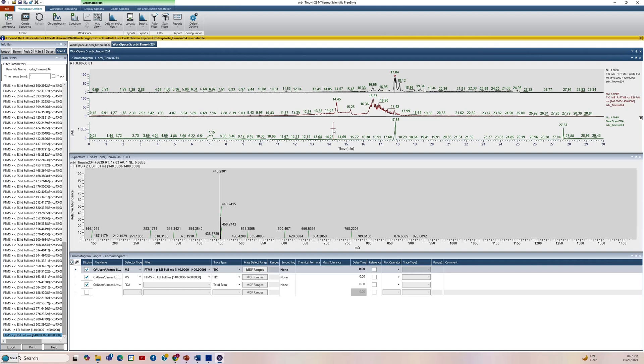So I hope this has been useful. And like I said, I'll do another one on nearby precursors to give you a little bit more information on it. But it's a nice addition to this, my favorite approach for doing the processing. So I hope you find it useful and hope it will help you to identify unknowns using the NIST search. Good day.